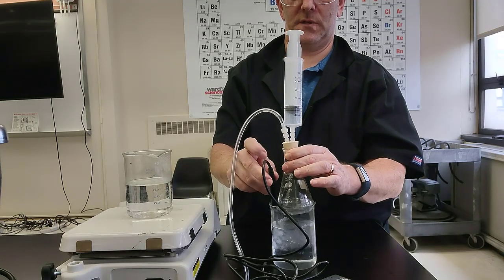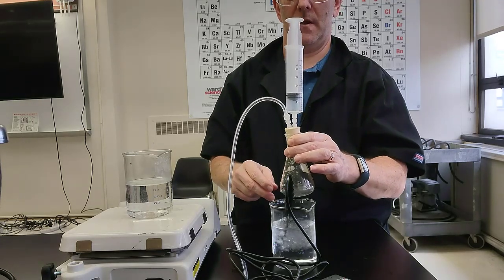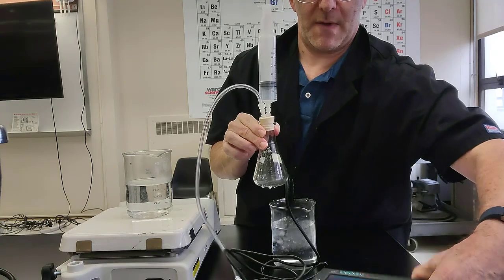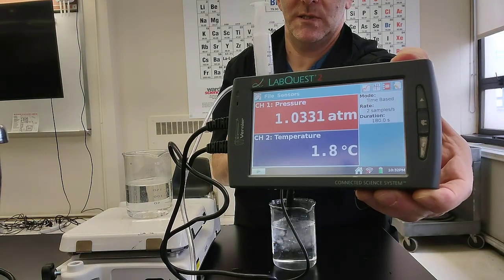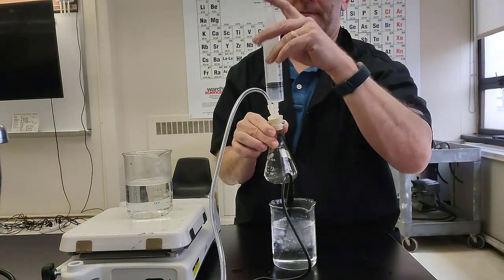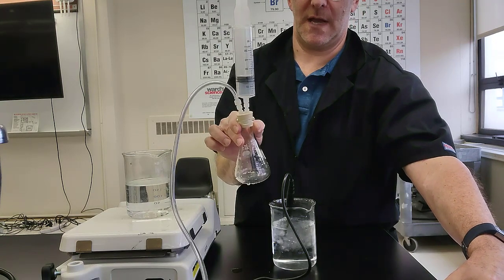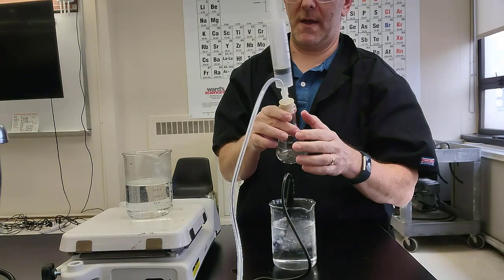The exact volumes don't matter because we're not doing this super quantitatively. But the flask is definitely cold to the touch, and the syringe bounces back, and again, we're really, really close to 1 atmosphere, which is what we would expect because that's where we started. And I've let the syringe move freely by pressing on it, expand it, and it stays pretty consistently right around 15 milliliters at this cold temperature. See what happens as we warm it back up.